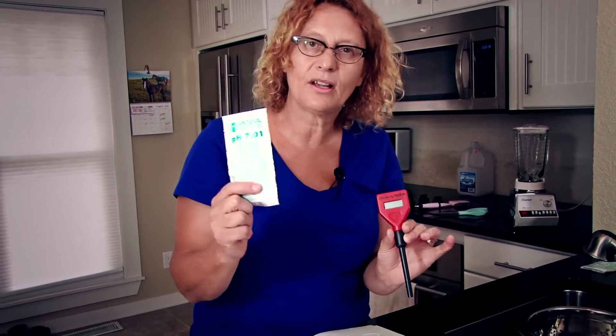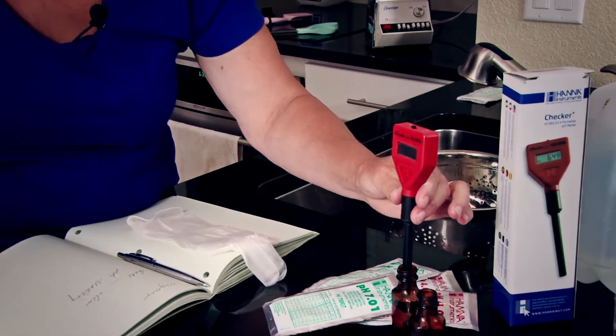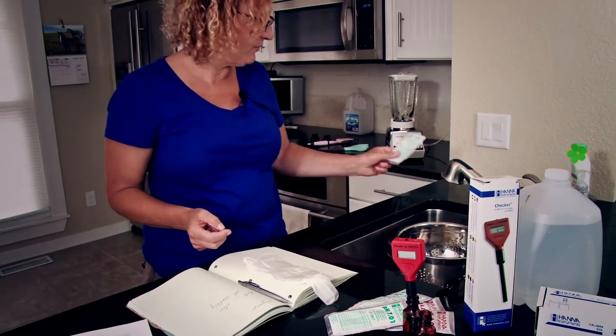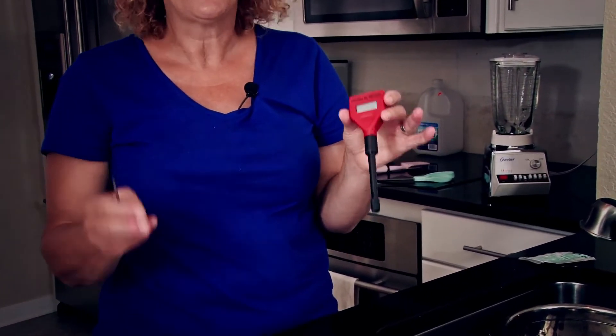I also bought packages of pH buffer solution for about $16. There are four packets of each in the box, so you have four chances to test your pH on different days. This meter is brand new, so the first thing you want to do when you open it up is take off the tip. This part is called the electrode. In order to season your meter, you just need to put it in a little bottle of pH 7.01 solution. All I did was open up a packet, pour it into the bottle, and that's been soaking in there for a couple of hours. Once that's done, it should be seasoned. When you put it away to store it, there's a little glass bulb at the tip that you never want to touch — always put a little bit of pH solution in there, wet the tip, cover it back up, and then store it in a cool, dry place away from kids and pets.